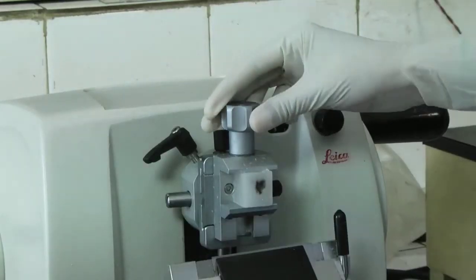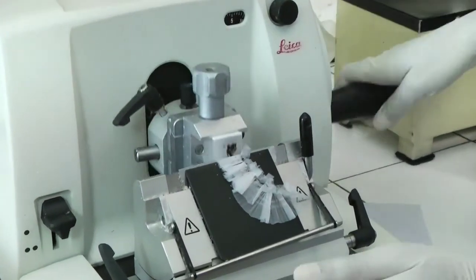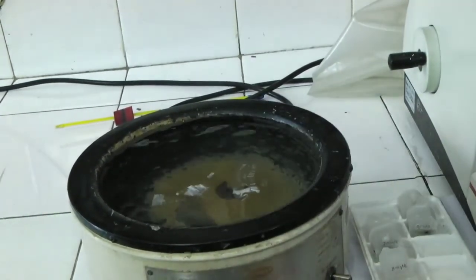After sharpening the microtome knife in the knife sharpener, each block of tissue is fitted in the microtome machine. Sections are cut at 4 to 5 micron thickness. Ribbons of good sections are selected, floated and flattened on lukewarm water in a water bath.